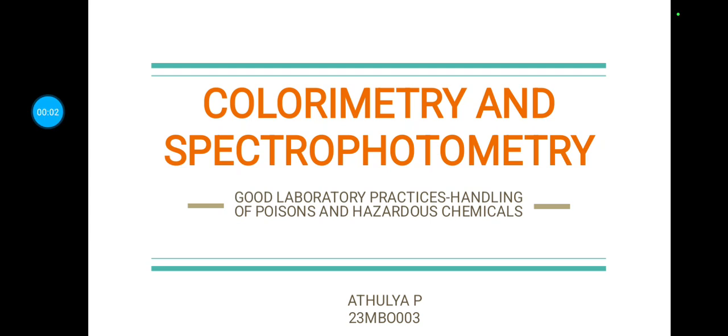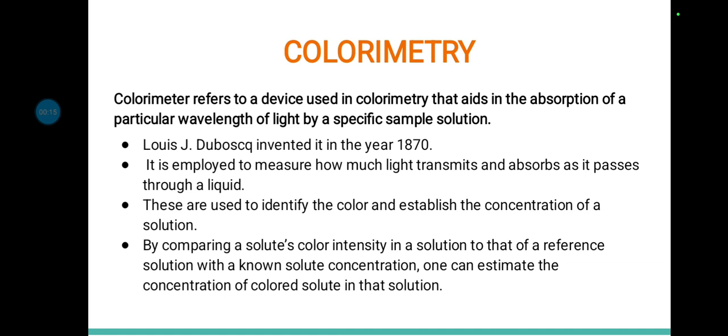Hello everyone. Today we shall look into colorimetry and spectrophotometry, also good laboratory practices, handling of poisons and hazardous chemicals. So let's first look into colorimetry.